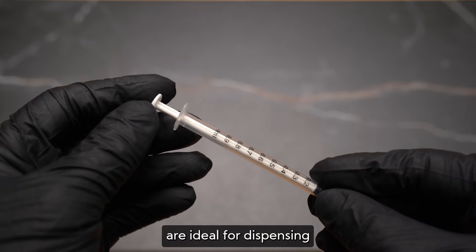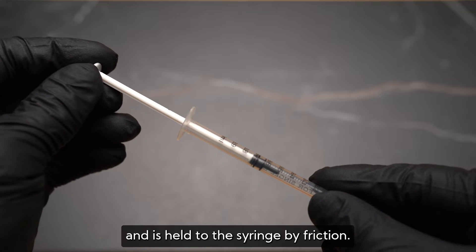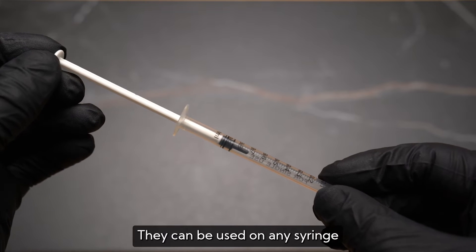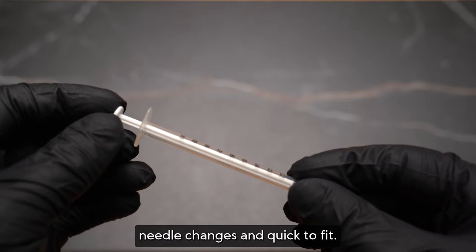Our disposable syringes are ideal for dispensing small volumes of liquids. Luer slip fitting is slip-on and is held to the syringe by friction. They can be used on any syringe with a luer adapter. Choose luer slip for when you need quick needle changes and quick to fit.